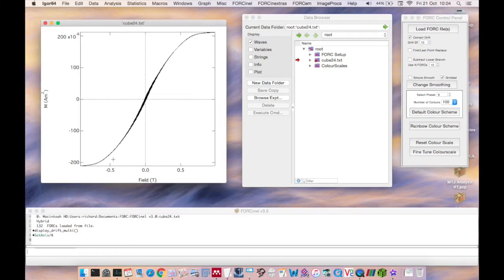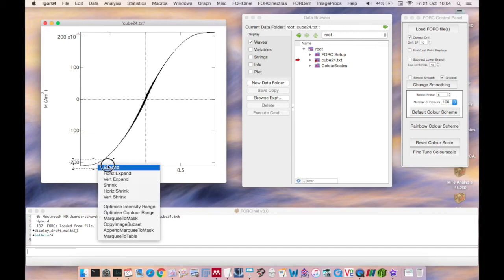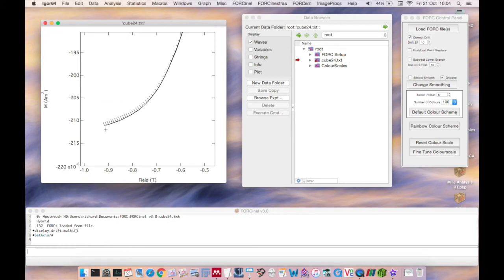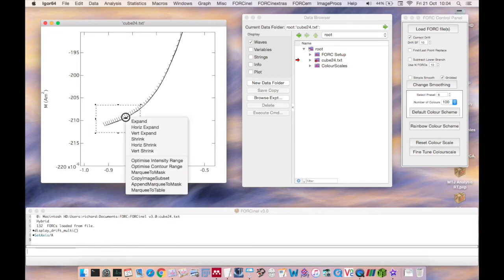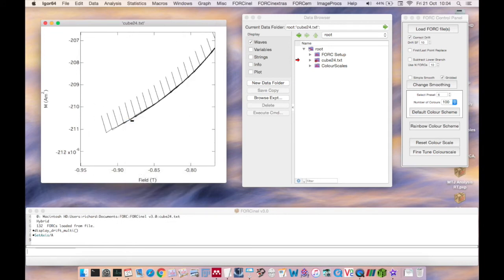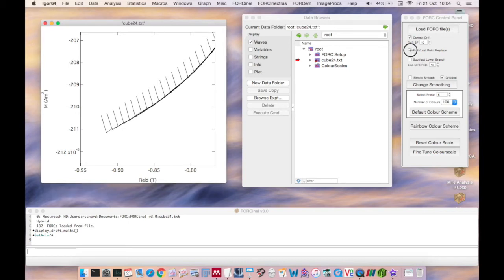If we zoom in to the data here, we can see the first point here is way off the trend of the other data points. And this will create a significant artifact in the processing. So we can choose now to remove that first data point by clicking the checkbox here.